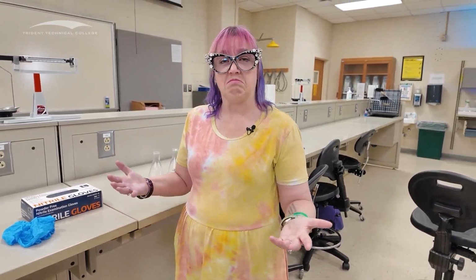So make sure we've got those dealt with, the gloves on. Anything that we deal with in the lab needs to be done that way. Anytime anybody is working with anything, doesn't matter if it's chemical or not, for those labs, we need to be wearing those gloves, okay? So I think that's everything I need to talk about with the gloves. So thanks, guys. I appreciate it.